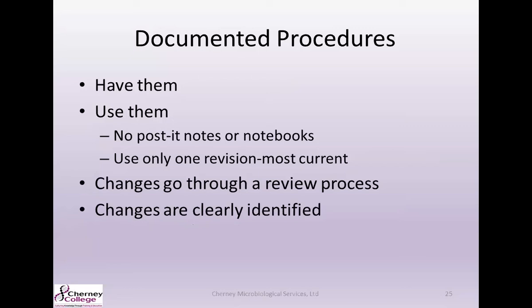So as far as documented procedures, obviously once you have validations completed, you're going to want to make sure that all of the lab techs know where to find those methods, those SOPs, in case they need to reference certain steps during the process. Make sure techs know not to deviate from any of those procedures and only use the most recent controlled method. Don't let lab techs print out and keep procedures, because if you make changes, they could still be referencing an old document.